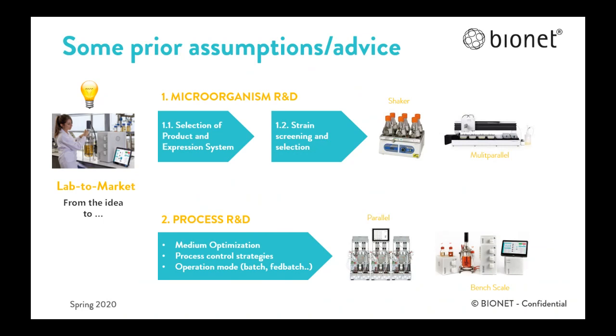This stage is to provide the master manufacturing formula, identify the critical features of the process, evaluation, validation, and finalization of the process. Also obtain the guidelines for production and process control, review of the processing equipment to produce physically and chemically stable products, and conduct lab studies and scale-up planning at the same time.